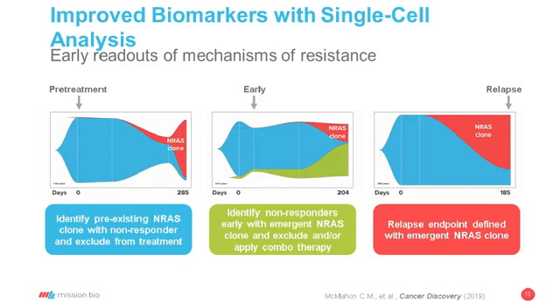You can look at it early in treatment because, again, the resolution is really high. And then the last example, this is just showing the combination of NRAS mutations that ultimately led to relapse. So it gives you a power to really look at evolution that might be happening in many different ways, whether it's early in the disease or later in the disease.